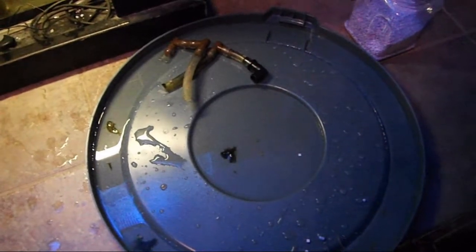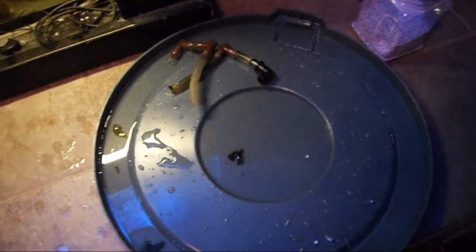Here's one video and you can see if you can figure out what that is. I've placed the specimen under the microscope and it's really fascinating to see details in things that you just cannot see full-sized. You can see these spikes and appendages and this movement. That's the creature itself moving around inside the specimen container.